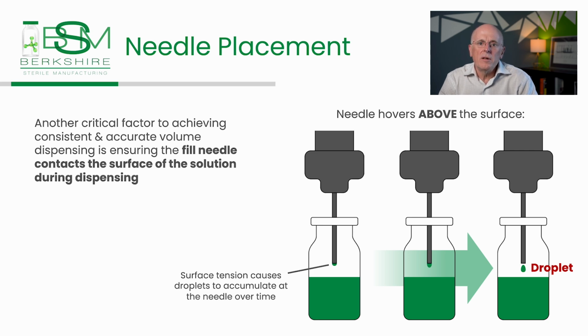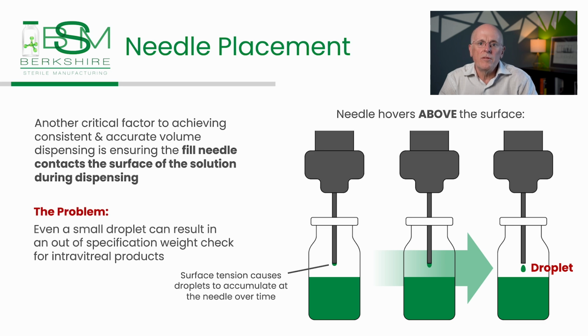In the case of volumes as low as those we work with for intravitreal drug products, even a tiny droplet can result in a weight check that falls outside the specified range, leading to the rejection of several units.